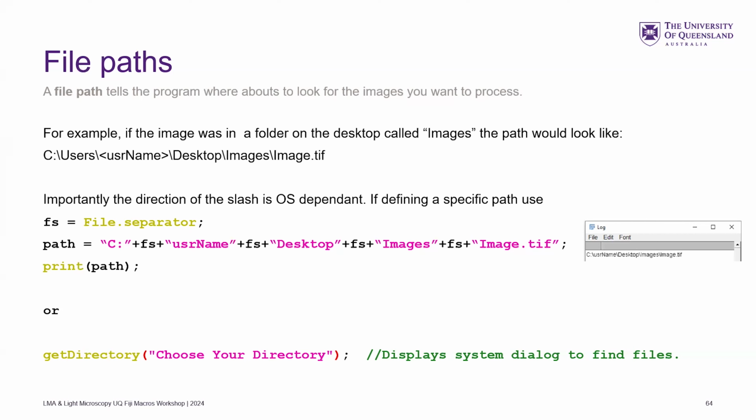That's one way of hard defining the path, but for more convenience, you'll probably use the command getDirectory. That will use the operating system's dialog to navigate to a folder. And you can see what's printed there.